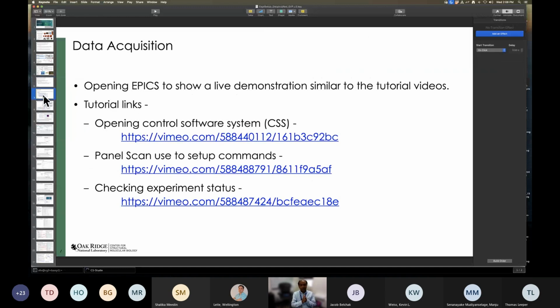Okay, so that's the simulator, and that's what you would use before, to know how much concentration would give you reasonable data, as well as whether you need to measure in D2O or not. Now, these are very simple cases.